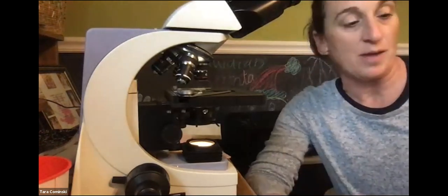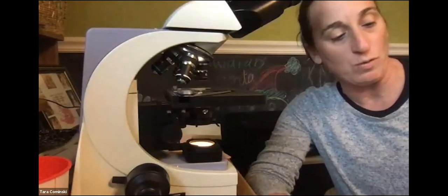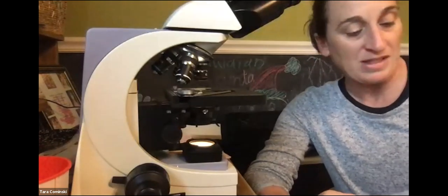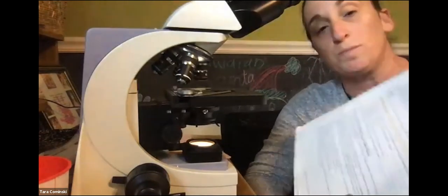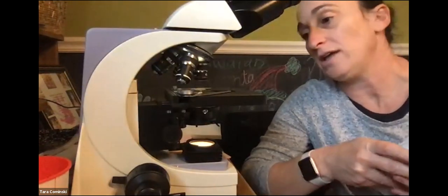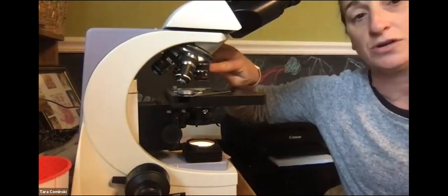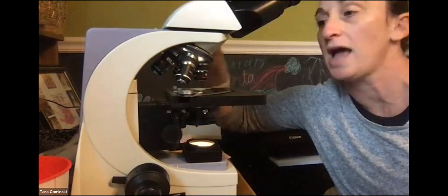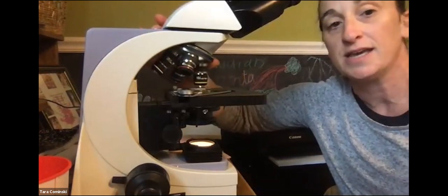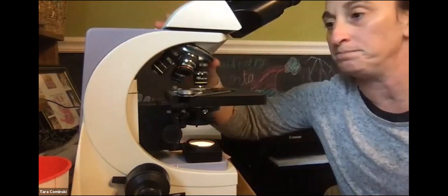The other thing is on page 21. That's where you see the inversion part of that. I will go through that in a second, okay? At the bottom of page 21, it mentions the word parfocal. We should know what that means. Basically, if I have the object in focus under scanning, the 4x, and I switch my objective to the 10x, it will remain in focus. That's what parfocal means. So just so you know.